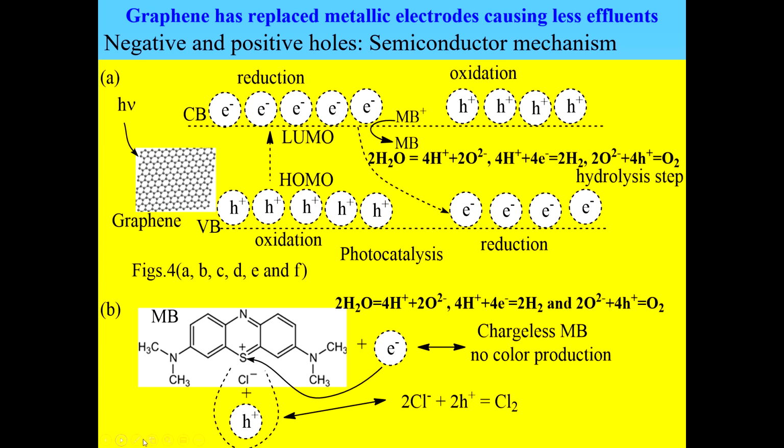It's a very surprising situation to us. Then the lid was coming out, because now chlorine is also developed here. We were shocked to see it, and we were not able to judge why the lid was coming out. Initially we thought that someone might have disturbed it. But when we carefully visualized, we saw that hydrogen, oxygen and chlorine gases are generated, putting a lot of pressure and uplifting the lid.